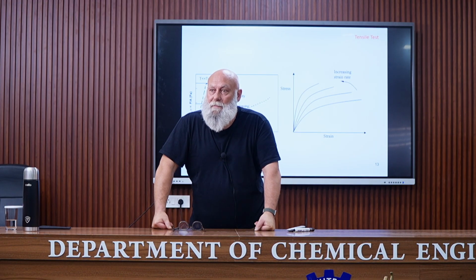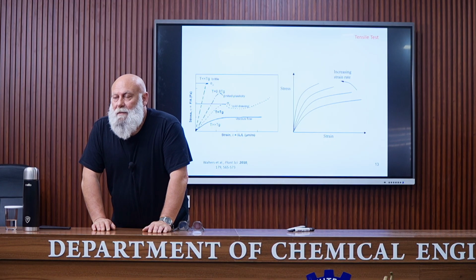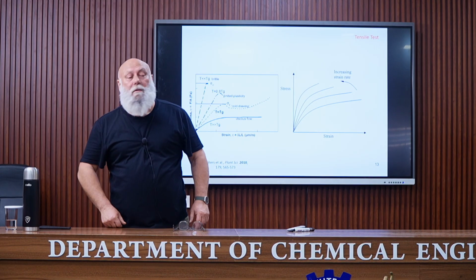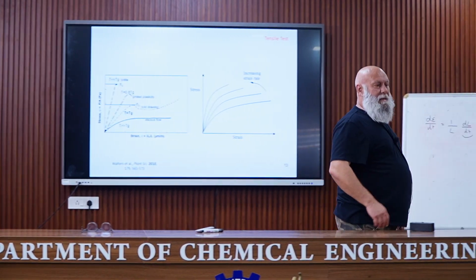Sir, one more doubt regarding the DMA, dynamic mechanical analysis. You are saying we can calculate stiffness from there, but from the tensile test also we can calculate the stiffness, right? Which is more accurate? It's not the same test.